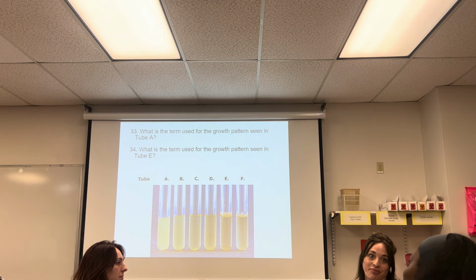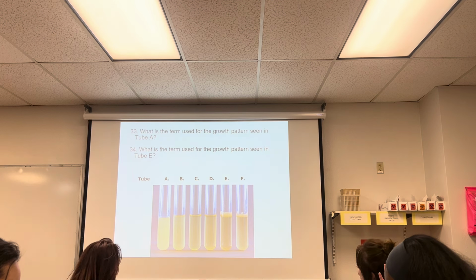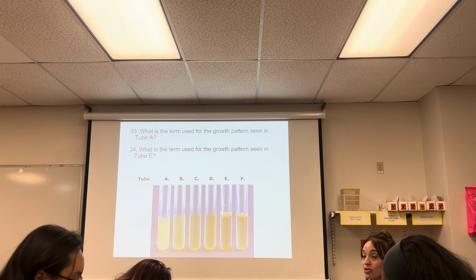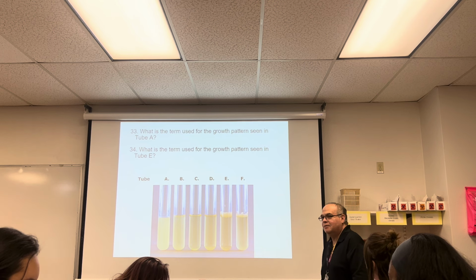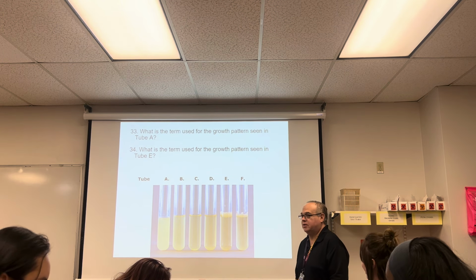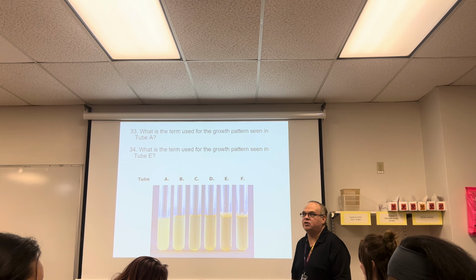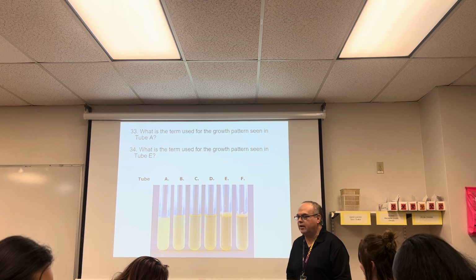Okay, so now this is broth. This is just plain broth, right? So what is the term used for the growth pattern in broth? Turbidity or turbid? That's correct. If you said cloudy, I would frown, but I'd give you credit because that's what it is, except that's just not a scientific term. Cloudy means you're out with your boyfriend or girlfriend, you look up at the clouds and you're all romantic. Oh, it's all cloudy today. Yeah, okay. It's different.